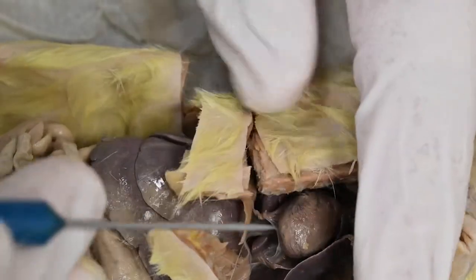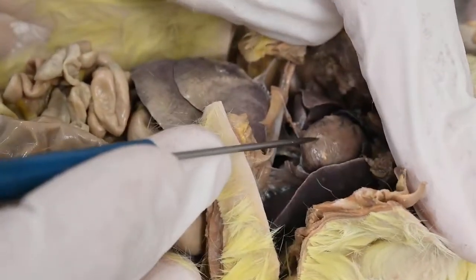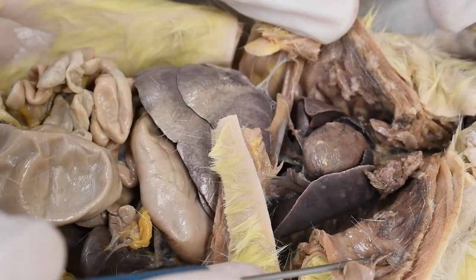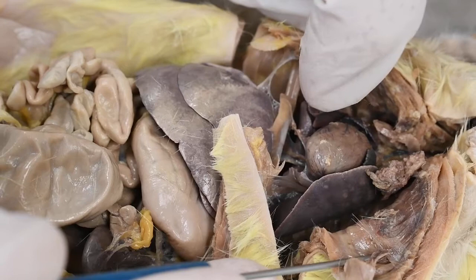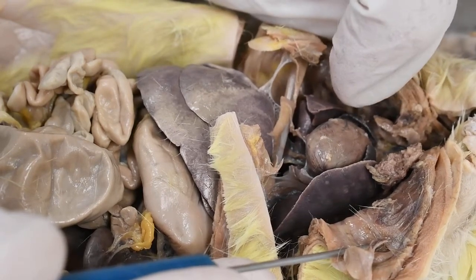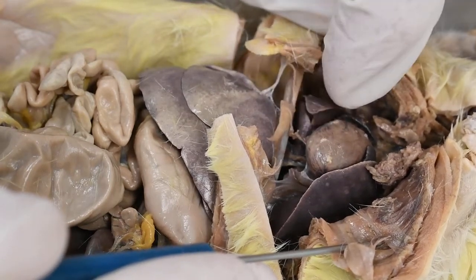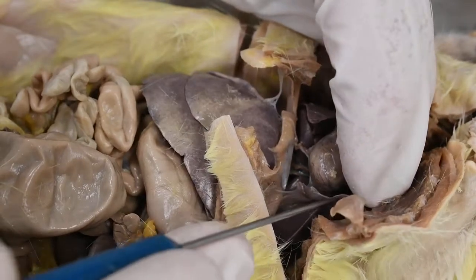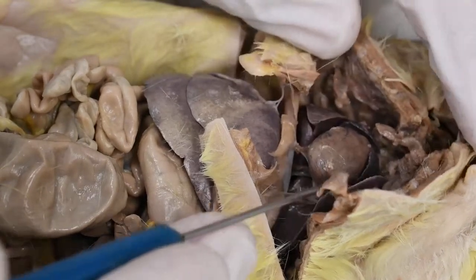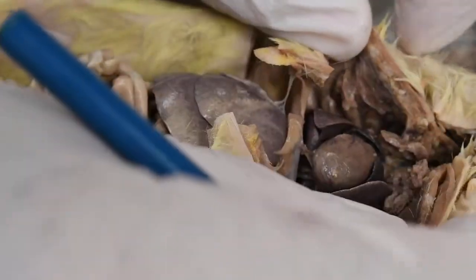And then here in the center, you can see the heart. Those are the two ventricles. So mammals have four chambers in their heart. They have two ventricles and two atria. The atria on the right and the ventricle on the right contain deoxygenated blood. On the other side, they contain oxygenated blood. And the deoxygenated and oxygenated blood never mix.